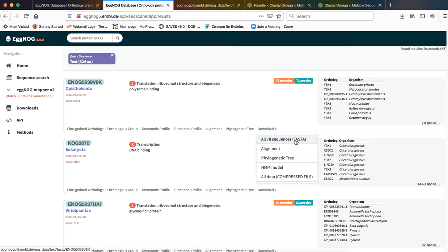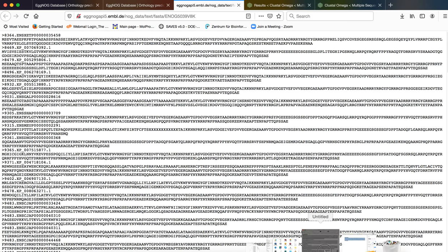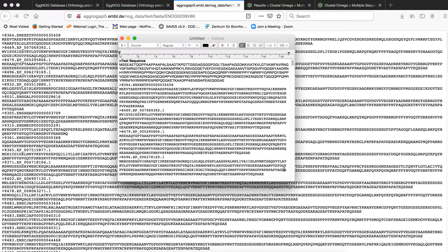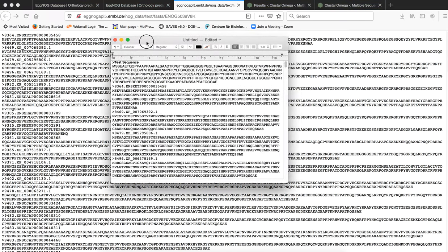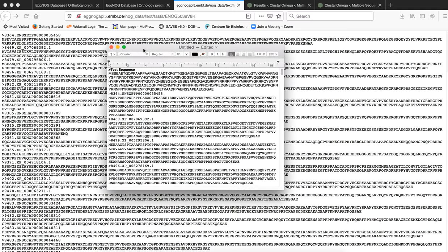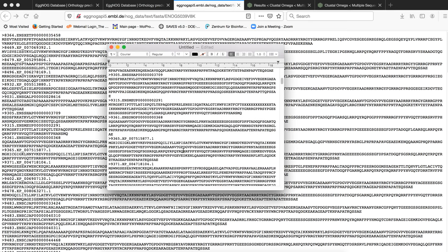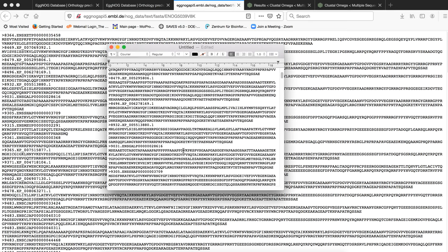If we click on this, then this particular page will open which contains all the 78 sequences belonging to this orthologous group. What we will do is we will copy these sequences and we will paste these sequences in a notepad file. As you can see this notepad file which has been created apart from all the 78 sequences of that orthologous group.